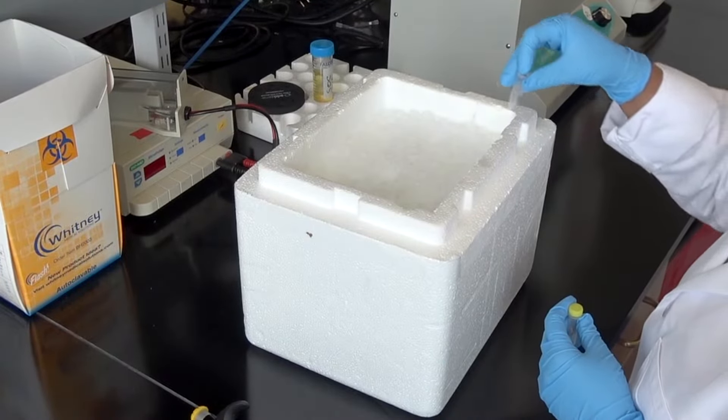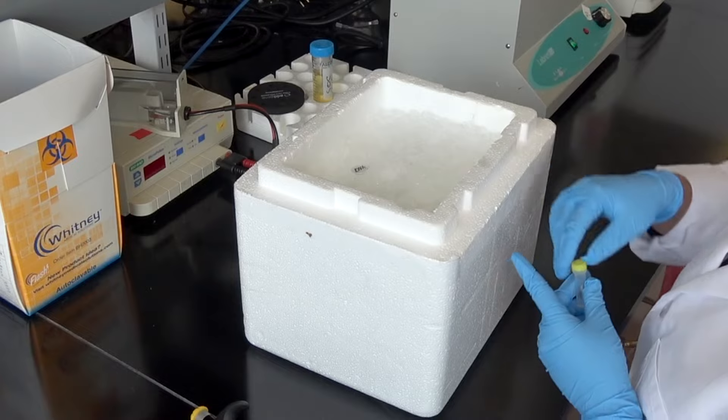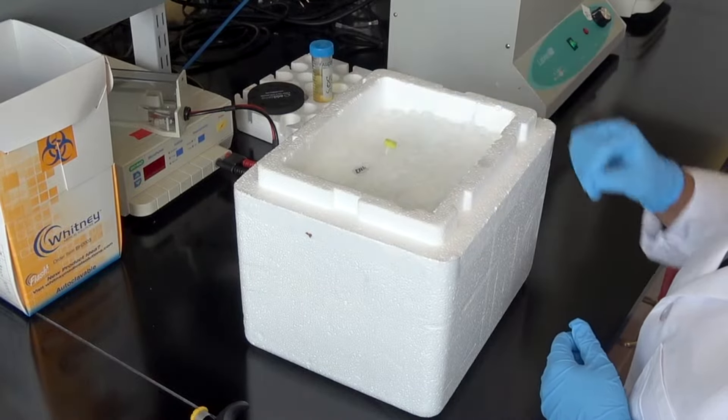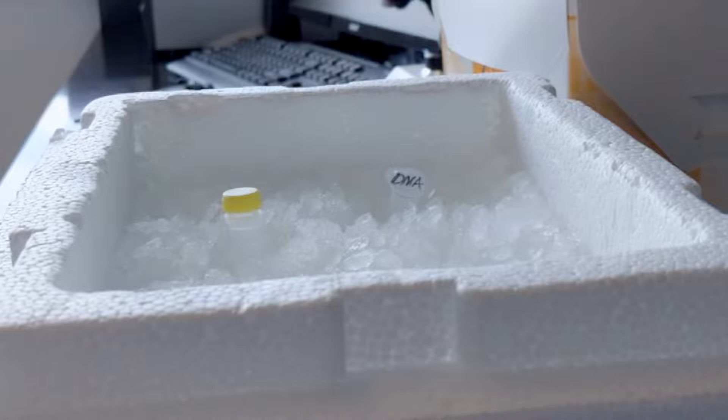To start the transformation process, thaw an aliquot of frozen chemically competent cells on ice for 30 minutes. There are several different types of chemically competent cells available commercially. You can also make your own using commercial kits or do-it-yourself protocols available online.